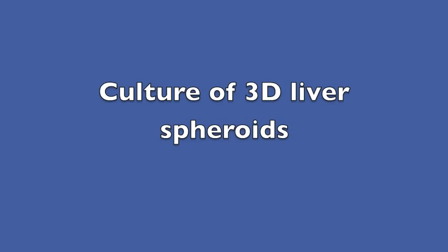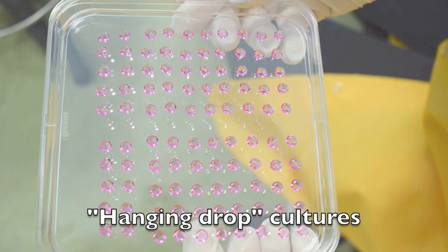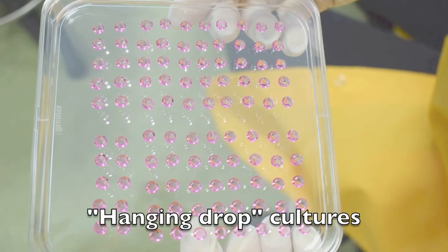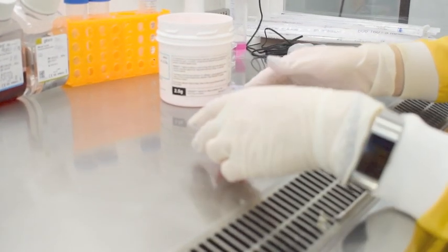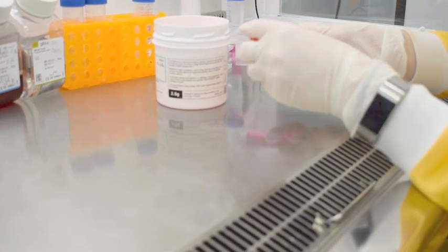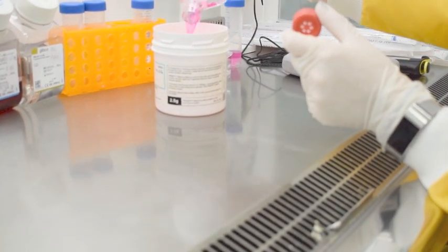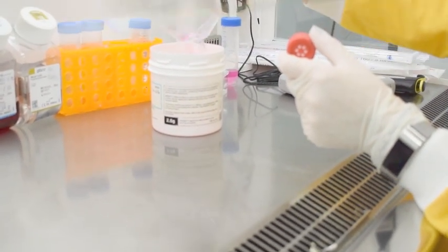Culture of 3D liver spheroids. Day 1 spheroid plate set up. Medium is poured off the monolayer of hepatocytes.